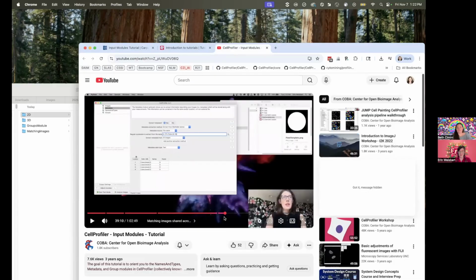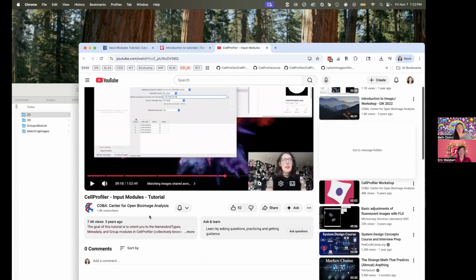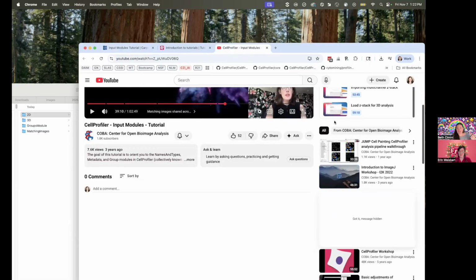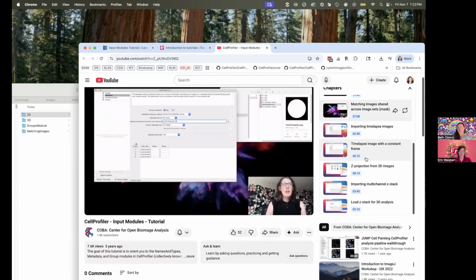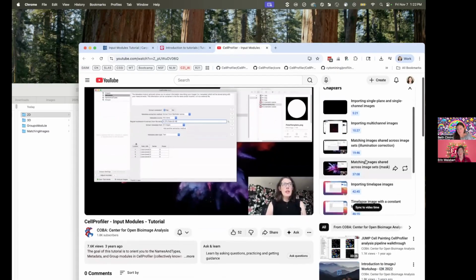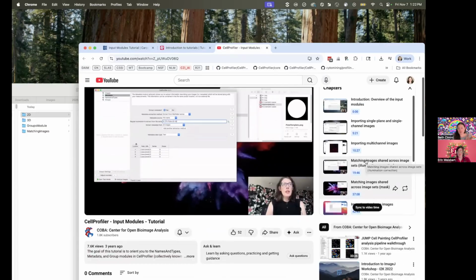I'm not going to do every single thing because, as you can see, this original tutorial is an hour, though it is guided into chapters so that if there's a particular thing you want to learn how to do, you can guide yourself to the right chapter. Now, I'm not going to reproduce the whole hour, but I'm going to give you a quick tour of the input modules and maybe pick one or two that I think are super important. Does that sound good? Sounds great.